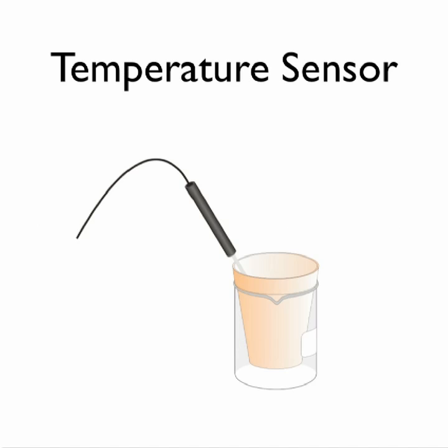Measure out precisely 25 milliliters with a clean graduated cylinder of the 0.5 molar sodium thiosulfate solution. Note, please do not mix these solutions yet. Now you click the Collect button to begin your data collection on the computer. You let the program gather and graph a few initial temperature readings, about 4 or 5 is sufficient, and then you quickly pour in the sodium thiosulfate solution. You stir the reaction mixture with the temperature probe.